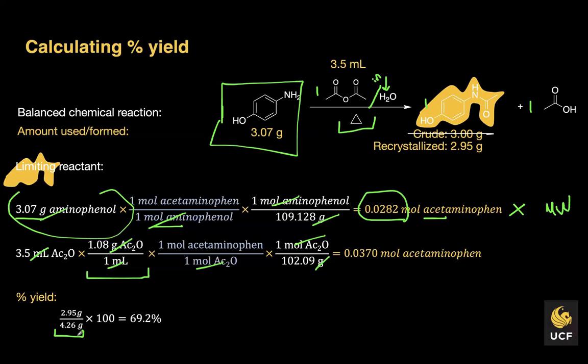So it's important typically to calculate the limiting reactant ahead of the lab. That way, you know, would it matter if I measured 3.6 milliliters or 3.8 milliliters in the lab? No, because that was the reagent that was present in excess, right?